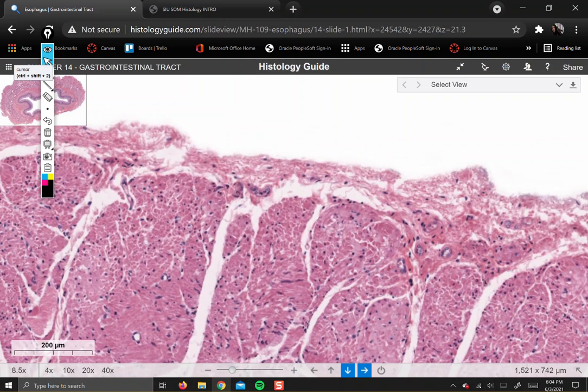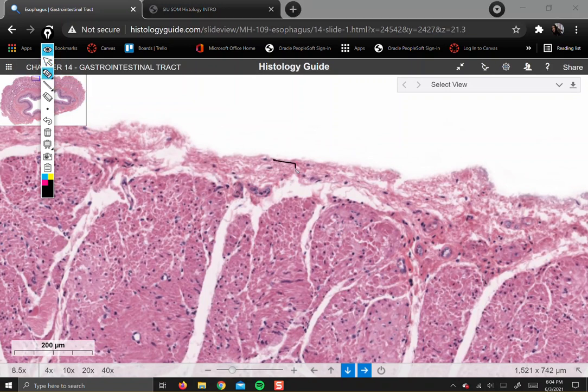And this looks like some looser connective tissue. So it's still lined and covered. It's not just bare smooth muscle. We have to have a place to anchor the little blood vessels that are going to supply blood to all this smooth muscle after all. It's just not as thick as that spot I showed you earlier because this area is not where the esophagus is sticking to the trachea.